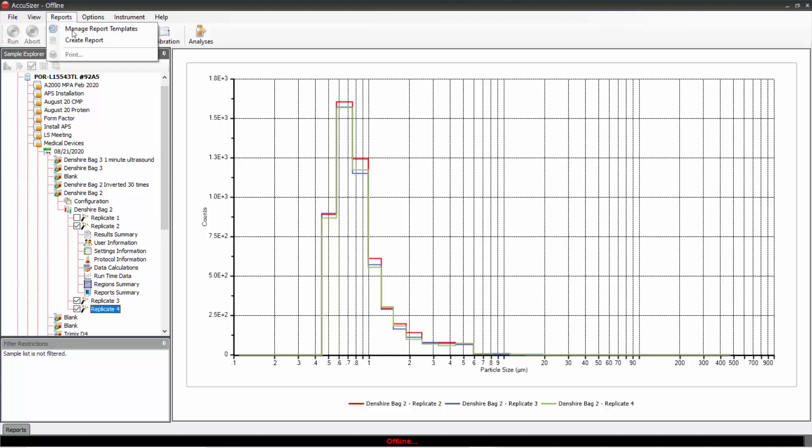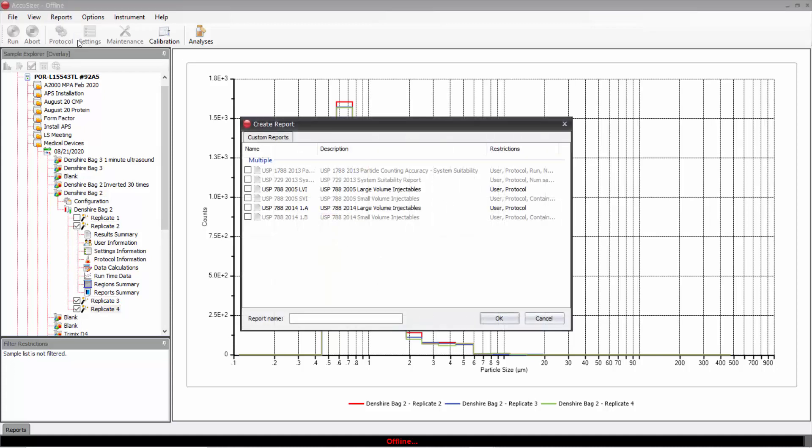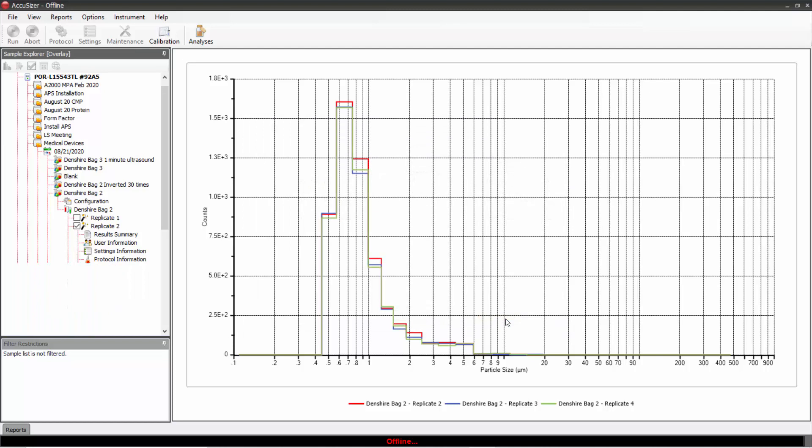Then I come up to Reports, Create Report. In Create Reports, I will choose this one for LVIs. I enter a name here, just say LVI1, and click OK.